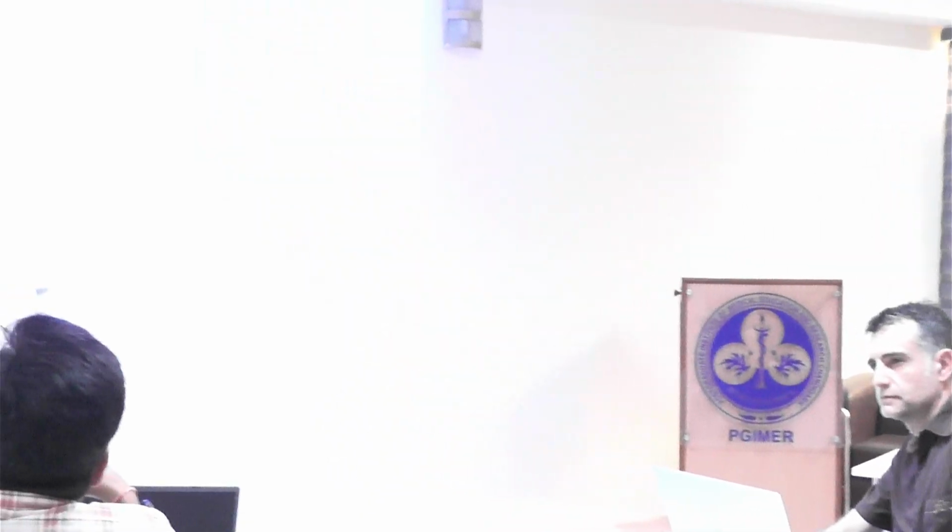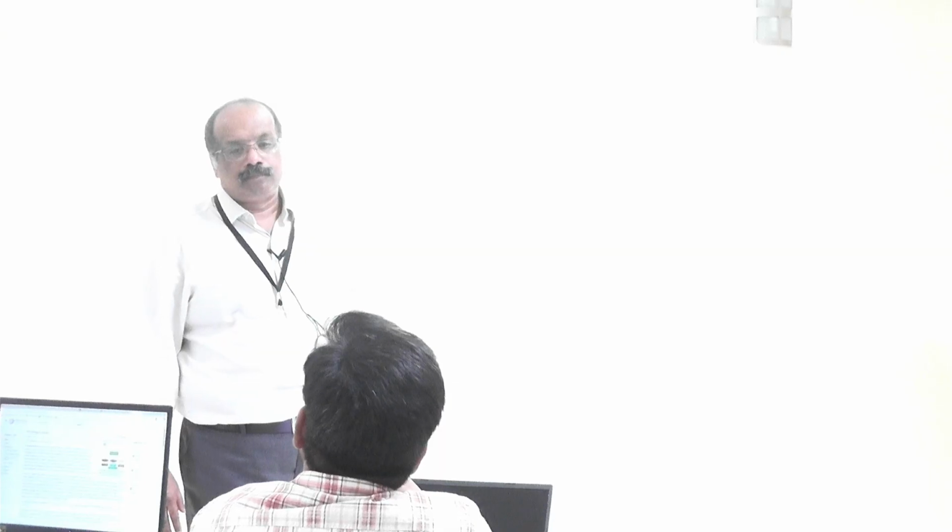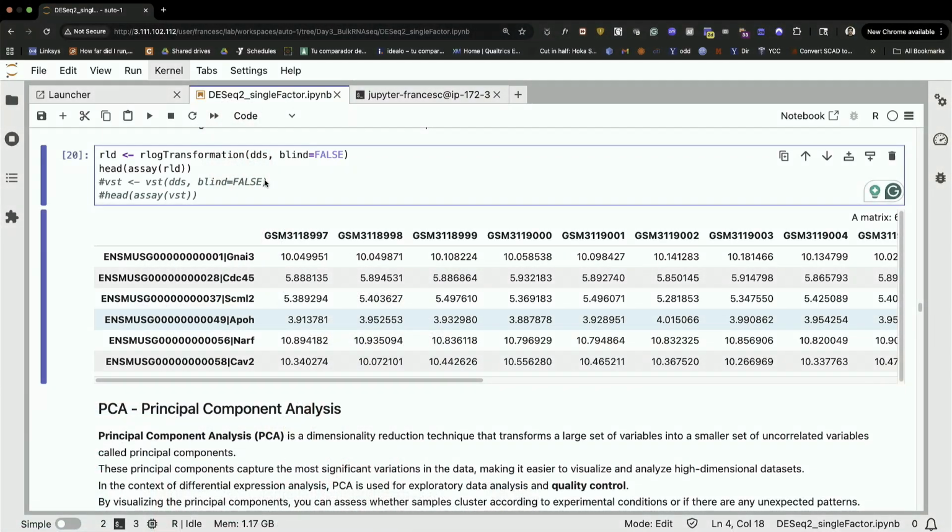We are doing single cell sequencing with Parse and 10x as well. The major problem we are facing is the fixation of the cells. In the Parse kit, they told us to fix the cells, and after fixation the viability is very low. In the 10x kit, they told us the viability should be more than 80%. So how will fixed cells be viable? In the 10x case, the cells are viable.